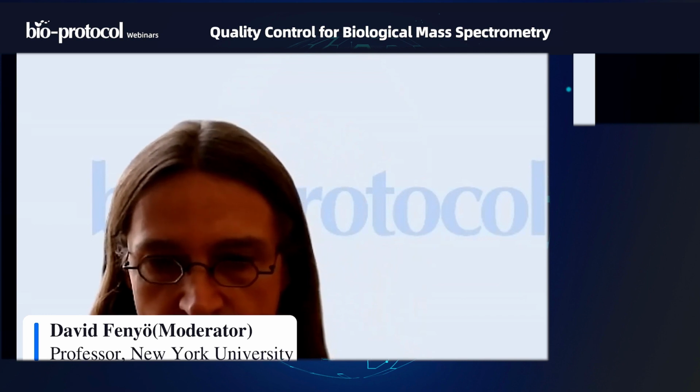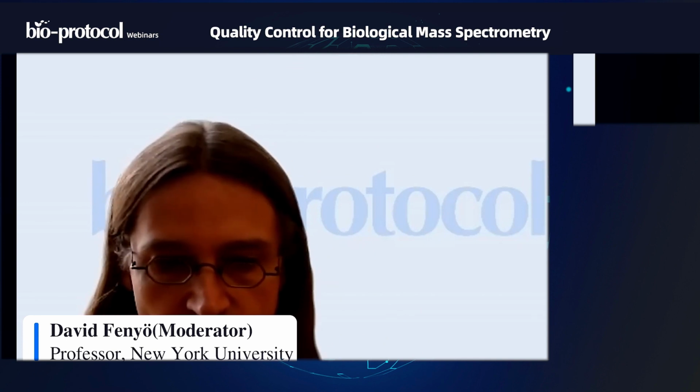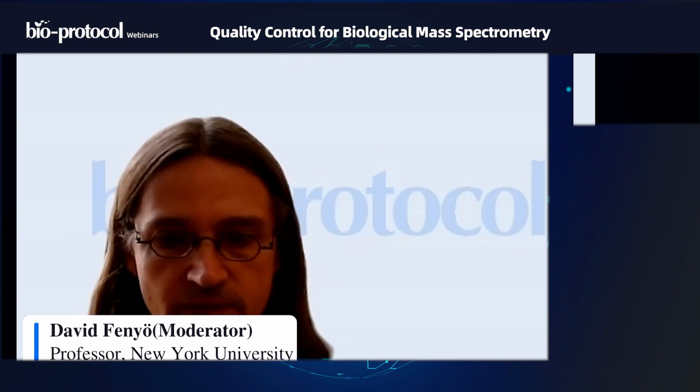So I have two batches of data related to DIA mass spec, and I'm doing biomarker discovery, but the results from each batch are different. In this case, how can I control for batch effect? Ideally, you had a sample held in common between the batches. If you didn't, do you have a QC sample that was run in both batches?